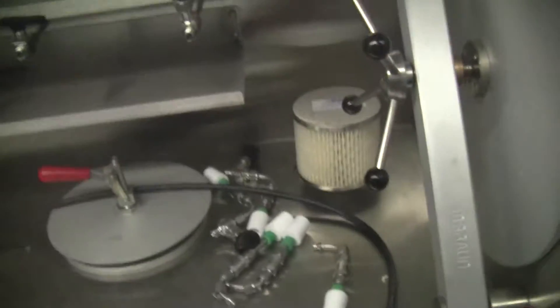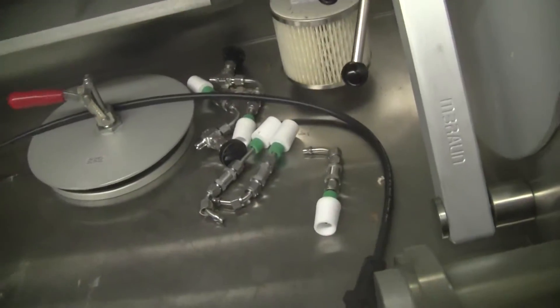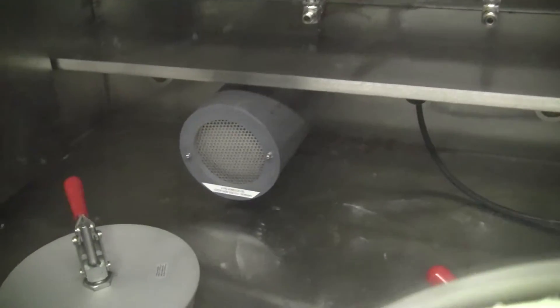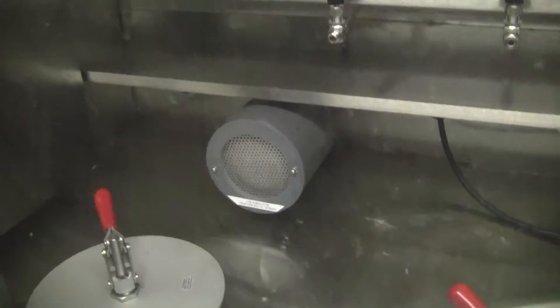We've got electrical, 115 volts going to the back through one of the accessory ports. Freezer.